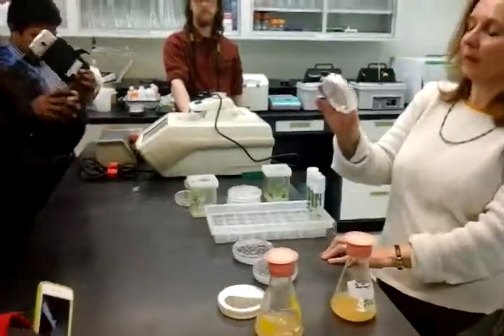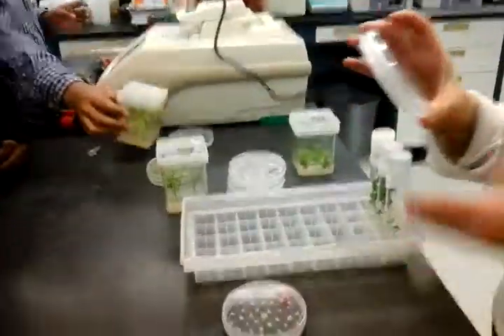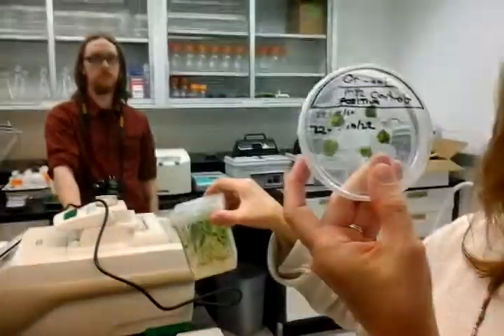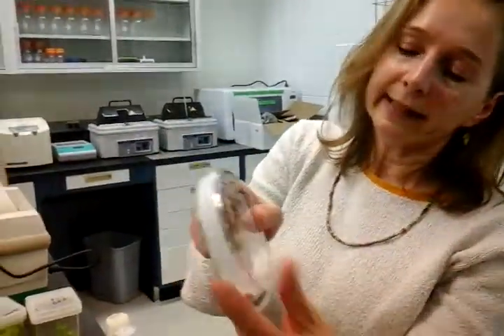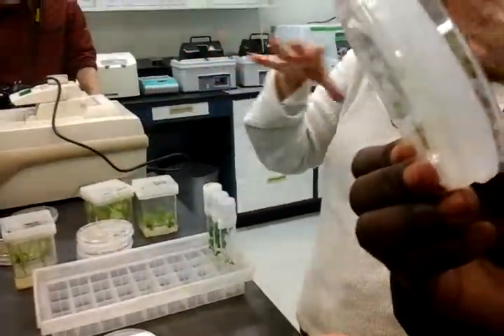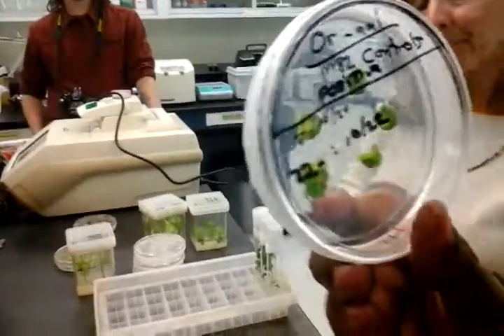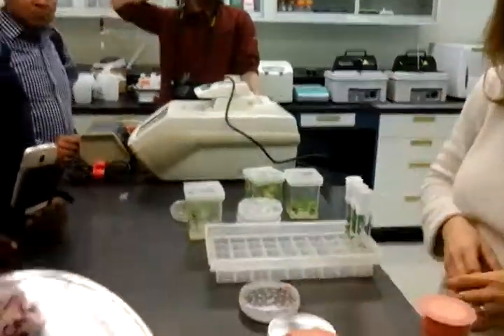These are some leaf pieces — actually this is a control, it didn't go into the agrobacterium — but you can see how much they've expanded. They're very thin when we put them on the medium and cut them in half, and you can see how big they've gotten. So we take those cotyledon pieces — the two seed leaves — cut them, and when you put them on the medium they just start to expand.